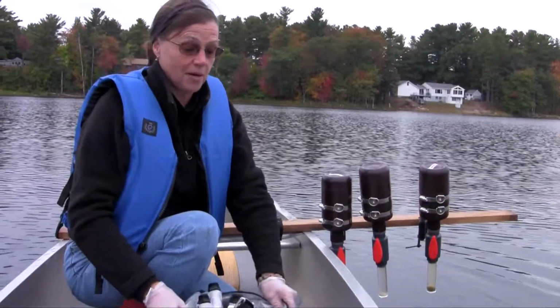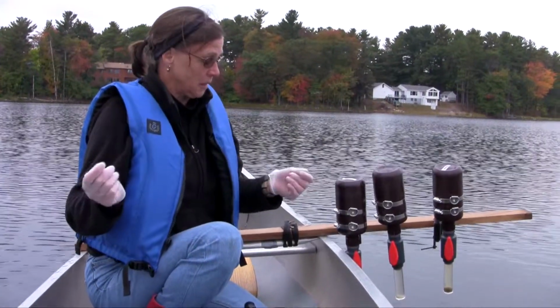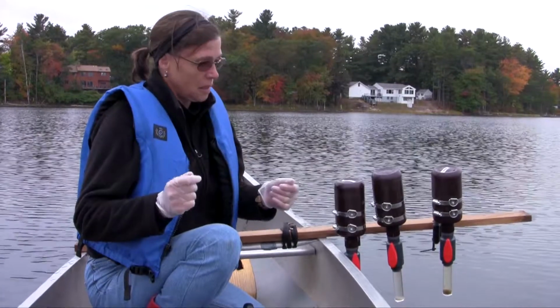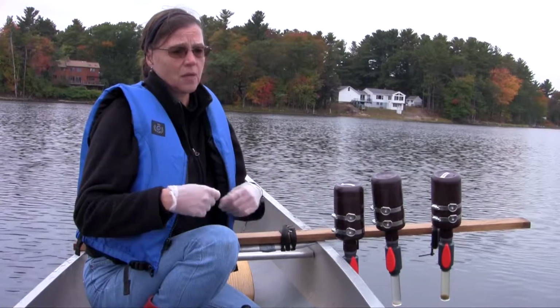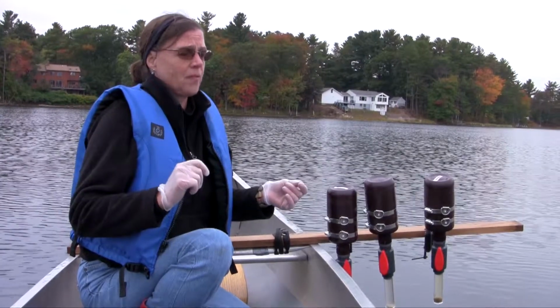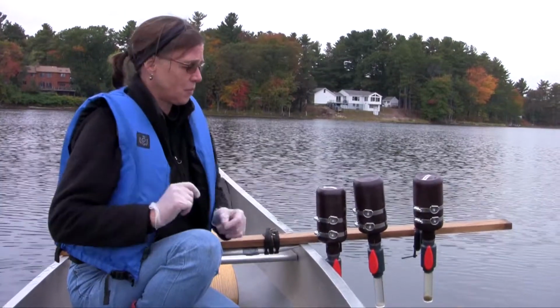So we've just completed our 20-minute separation process where we have physically separated out the zooplankton from the phytoplankton. And we're doing that because we want to be able to see how much toxin is in each compartment of the food web. And the samples will be brought back to the lab, and they will extract the toxin and look at weight-specific toxicity to see whether we have a situation of biomagnification or biodilution as the toxin moves from the phytoplankton portion to the zooplankton portion.